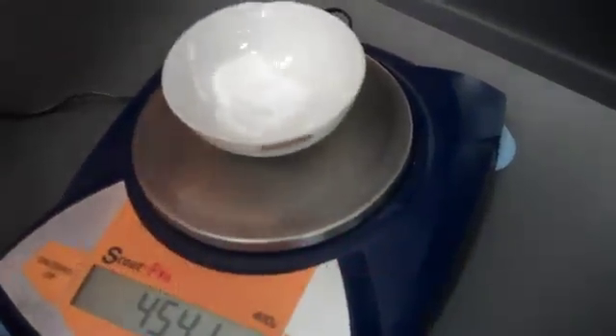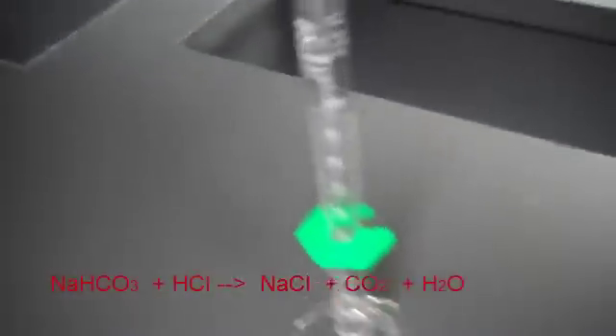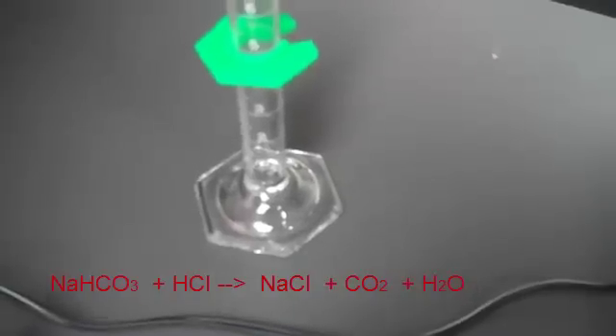Remember, be careful with hydrochloric acid. Measure out 5 milliliters of hydrochloric acid and add all 5 milliliters a few drops at a time until all the bubbling from the reaction stops.